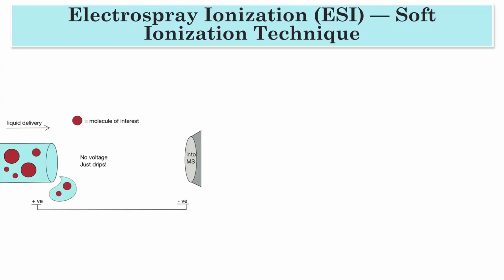Someone is asking how a sodium adduct is formed. Sometimes there will be some salt. Suppose you made your sample and you have some sodium chloride or some kind of sodium salt. Then you can get the sodium adduct. It doesn't need to be just sodium, it could be any other impurity. So you have to know these things. Of course, if your system has no sodium, then you cannot get an adduct with sodium.